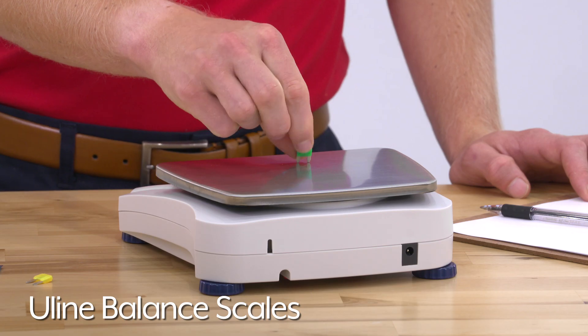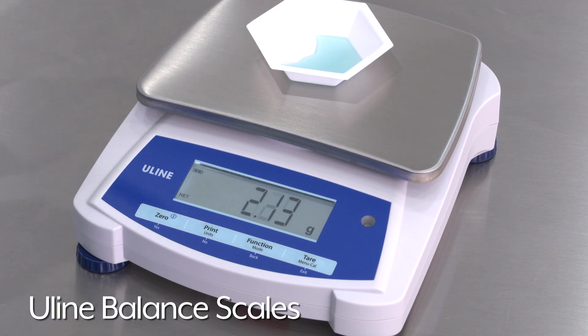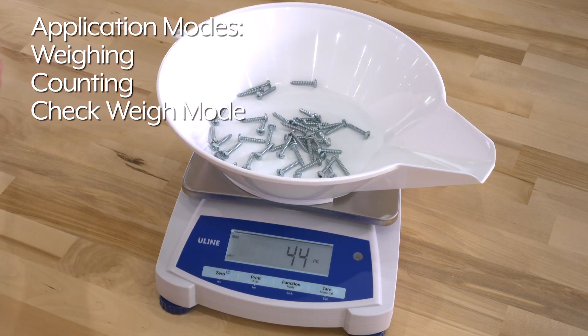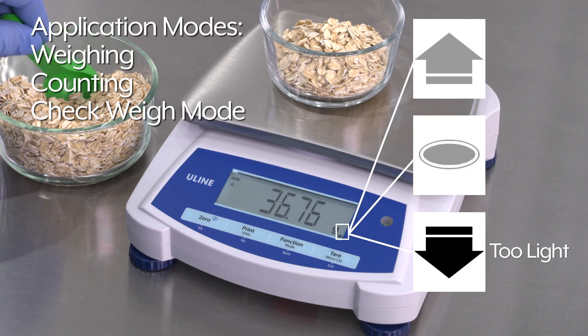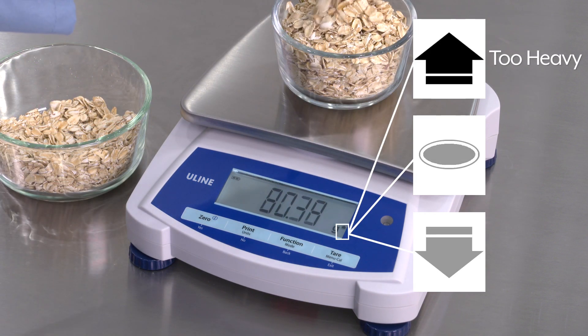ULINE Balance Scales precisely weigh and count small parts and liquids in manufacturing and pharmaceutical labs. ULINE Balance Scales have three application modes including weighing, counting, and check weighing mode to set low and high weight limits for portion control processes.